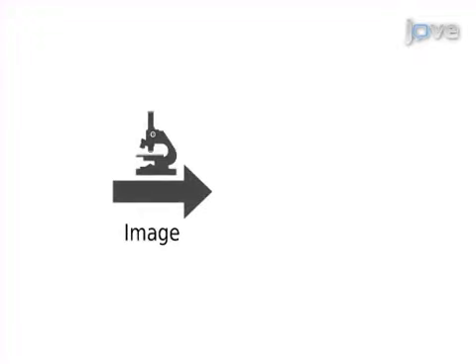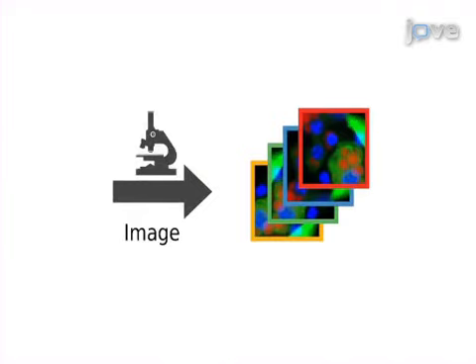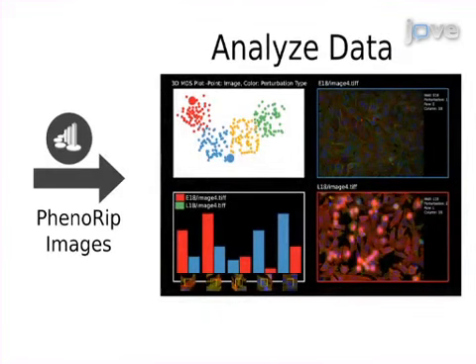Images are then acquired using an automated fluorescence microscope, and the images are semi-automatically loaded onto the PhenoRipper image analysis platform using the PhenoLoader tool. After setting the analysis parameters, PhenoRipper automatically identifies recurrent block types in the images and generates phenotypic profiles for each image that can be explored using the Pheno browser.